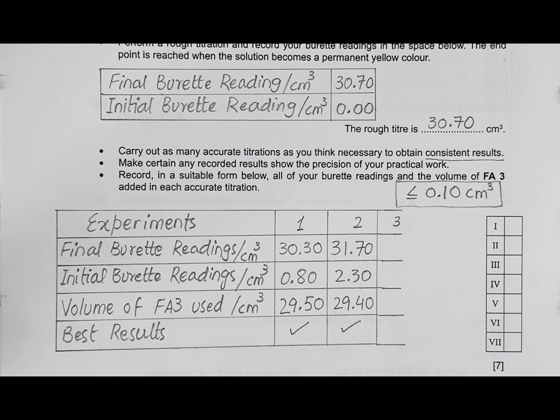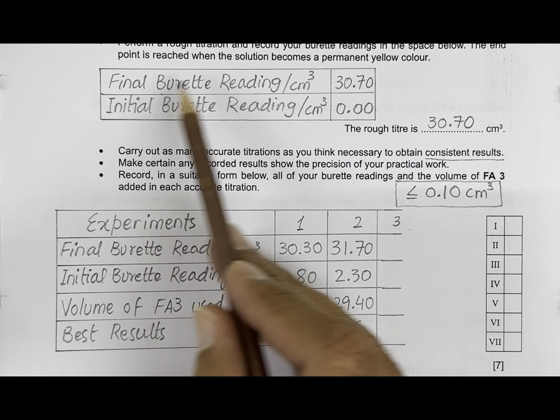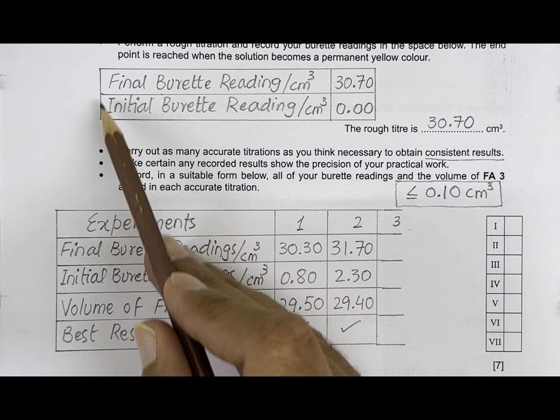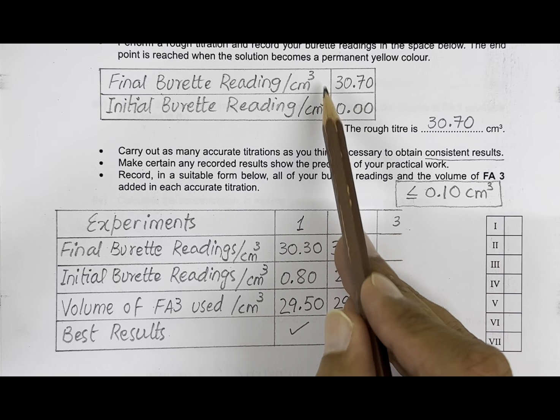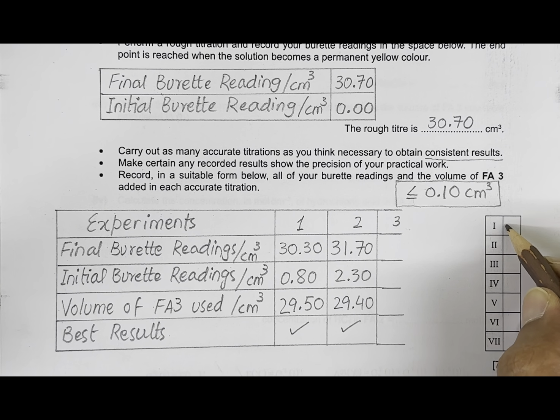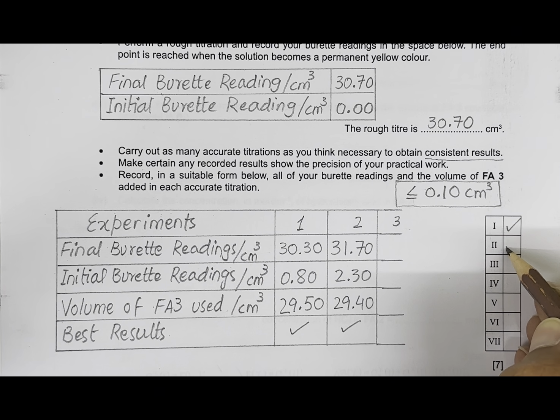Number 1, this first mark is for the initial burette and final burette readings for rough titration. So this 2 by 2 column here presents this first mark. The second mark is for the correct titles: final burette readings, their units, initial burette readings, volume used, here also. So the correct labels and the units account for the second mark.